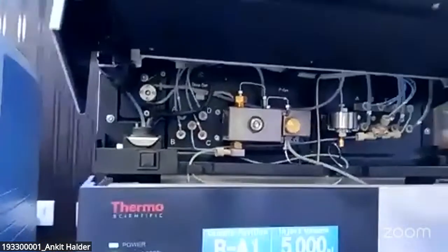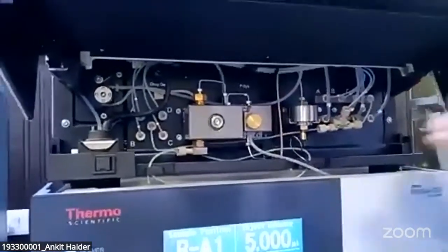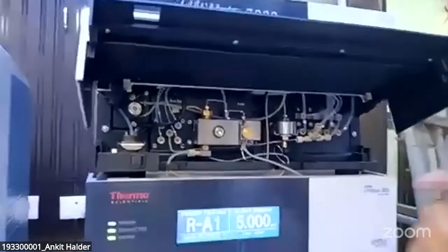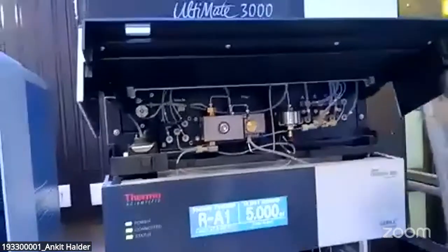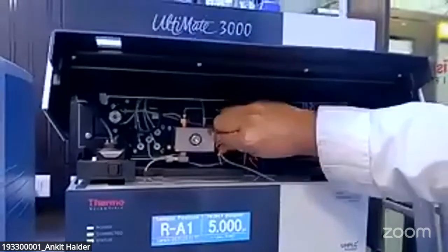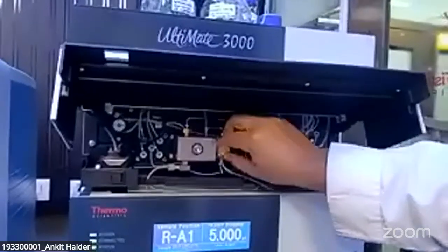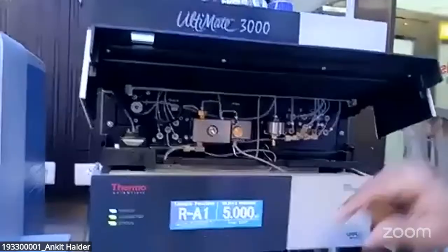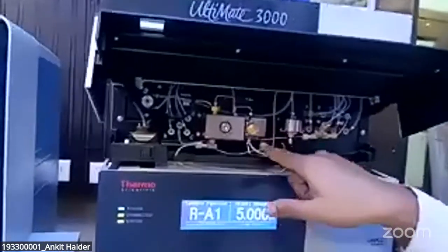Whenever you give new solvents for any kind of acquisition, whether it's untargeted or targeted, you need to get rid of any bubbles in the solvents. Okay, so you can just use these knobs and start purging the system. When purging, you will see all the bubbles getting out of this particular pipe.